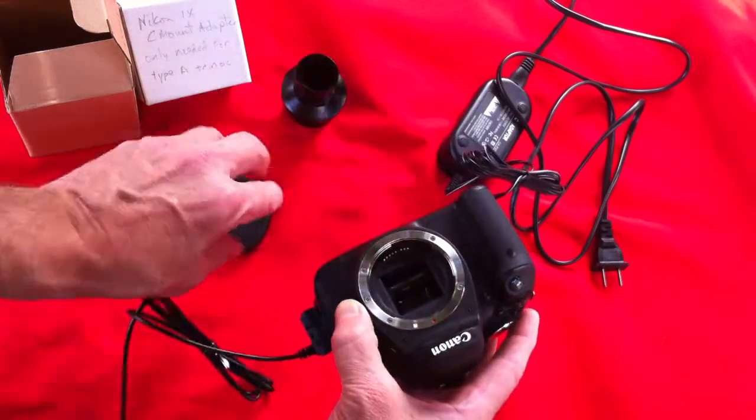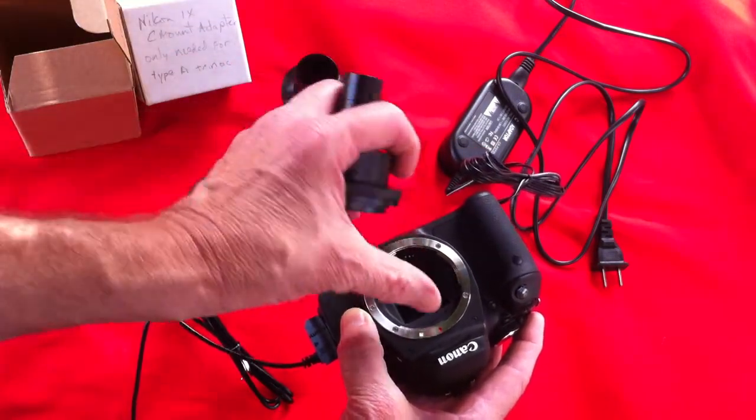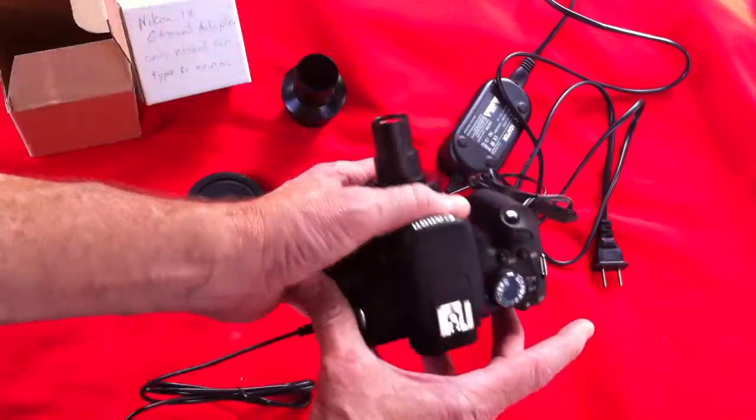In place of a lens we'll have the microscope adapter. Line up the red dot on the adapter with the red dot on the camera body and we're done.